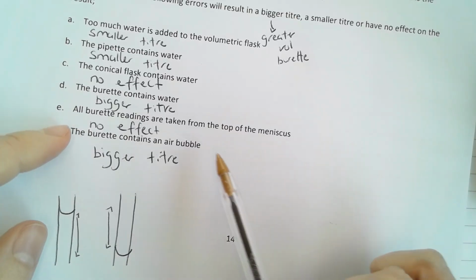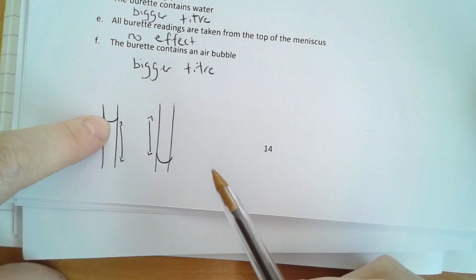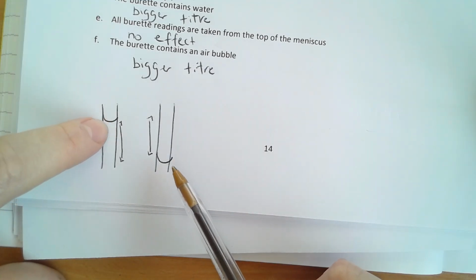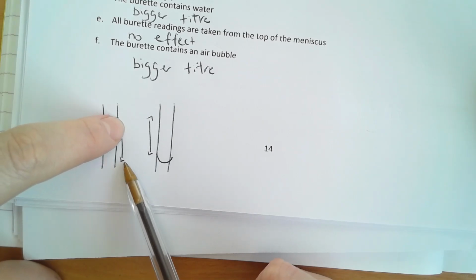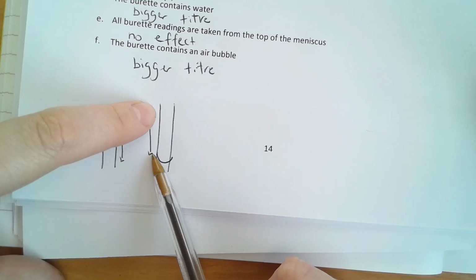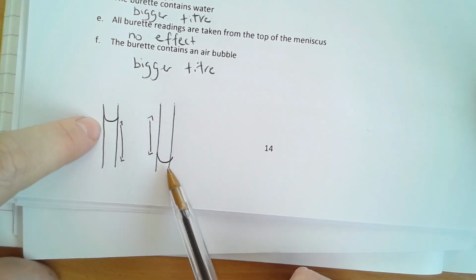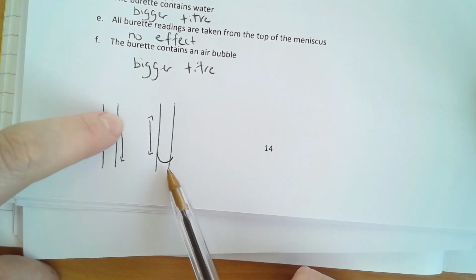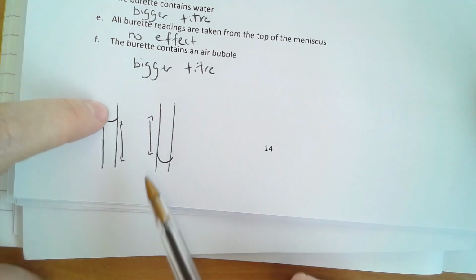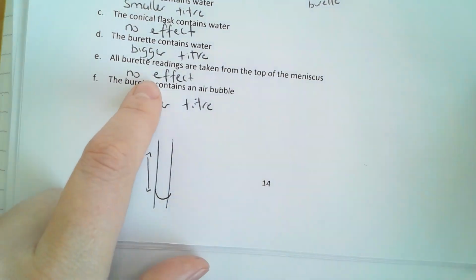If they're all taken from the top, it's not going to have any effect. I've drawn that out here. Say this is your initial and this is your final. You're always working out the difference. So if you measure the distance between the top of the meniscus and the top of the meniscus, the difference is the same. We read from the bottom because it's easier and you're more likely to be accurate if you read from the bottom. But because you're dealing in difference, if you make the same mistake twice, it effectively cancels out and it's not going to have any effect.